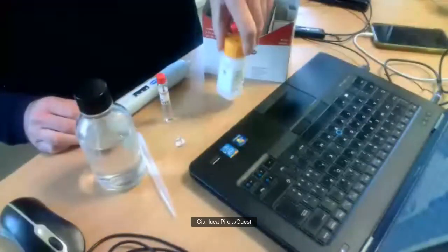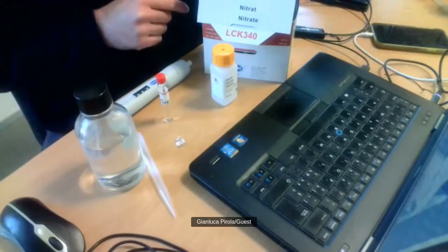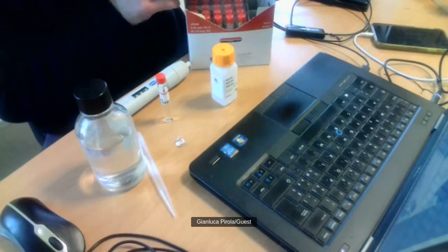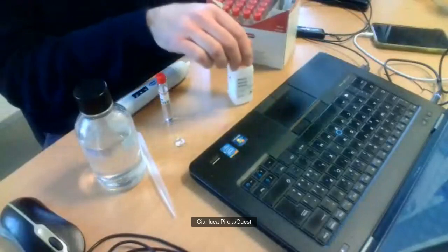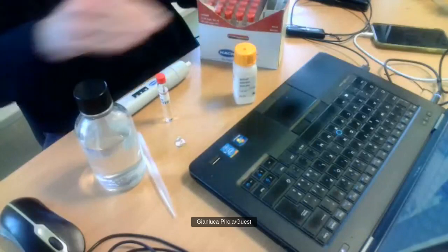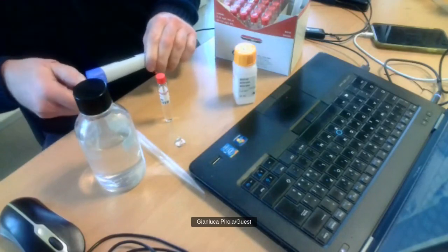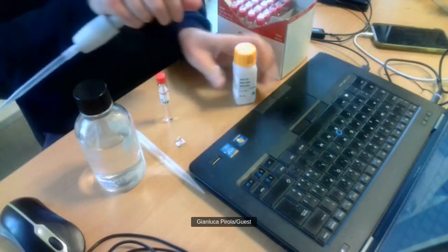Then later we have to dose the reagent A. You can put a tip inside your box here, and you will use this tip all the time you need to use this reagent A. You will use it just for this reagent, and this one just for the sample. Then the procedure says to dose 1 milliliter of reagent A.